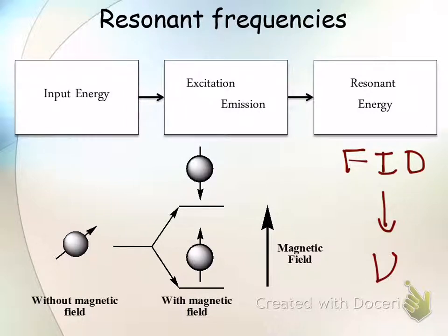We're going to stick it inside a giant magnet. Now the magnet actually looks like this. It's got a north, it's got a south, and it's got to be connected to be a magnet. So it looks something like that. And then you're going to stick your sample down in here. It's in the middle of this giant instrument. The big white box that's in there, that whole thing surrounds a little magnetic field space that's about this big. And it's to protect it from the environment around it.